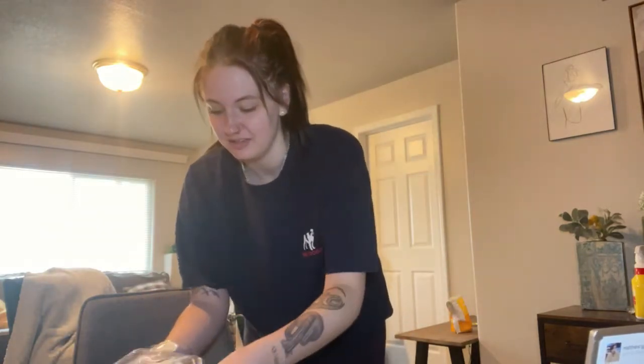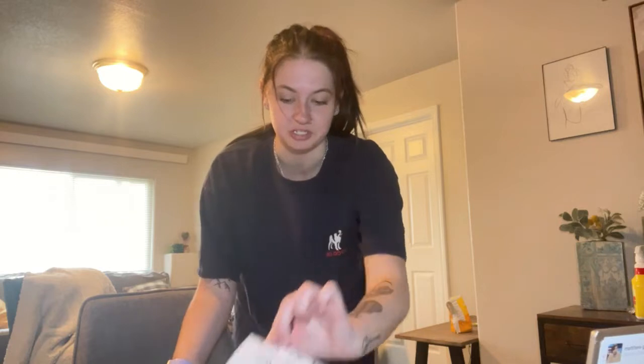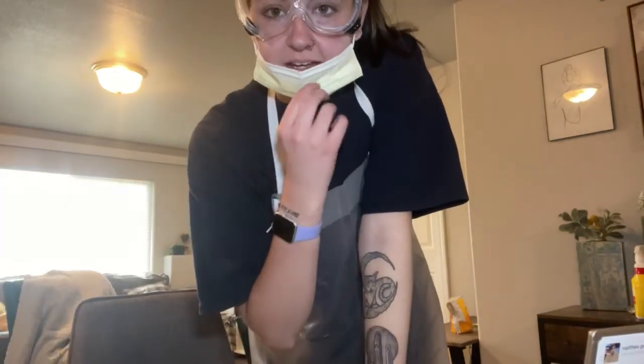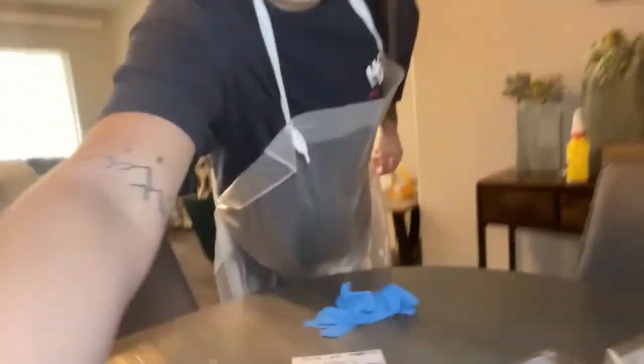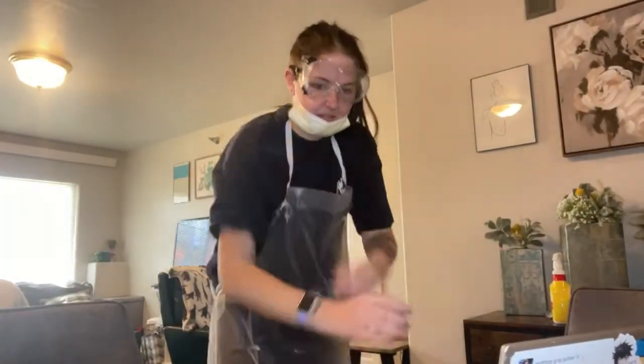Let me get my equipment. I also had to make a little photo card that has to go in the pictures. I'm gonna go grab a mask. I'm back. I got my mask. I am literally not kidding when I'm saying that this apron goes all the way down to my ankles, bro. I look like a butcher. What would you like today? A slab of meat?